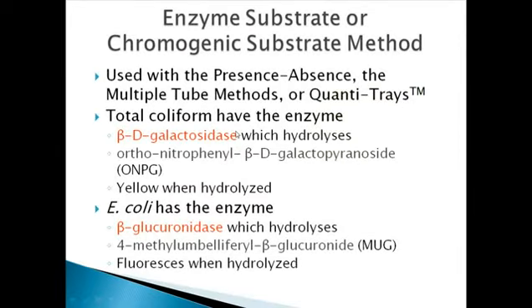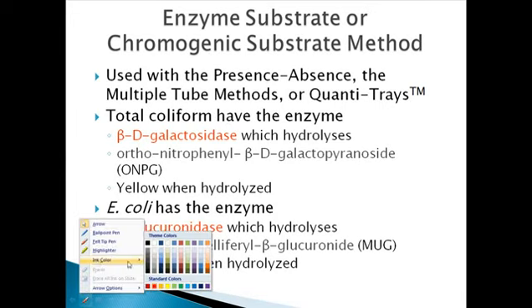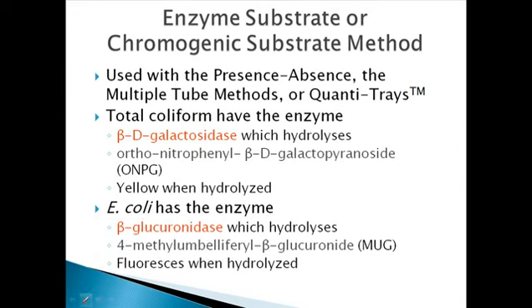Okay, now let's talk about different enzymatic reactions to distinguish between different forms of coliforms. Via the previous steps, the different presumptive tests are there to determine whether we found any coliform in the water sample or not.